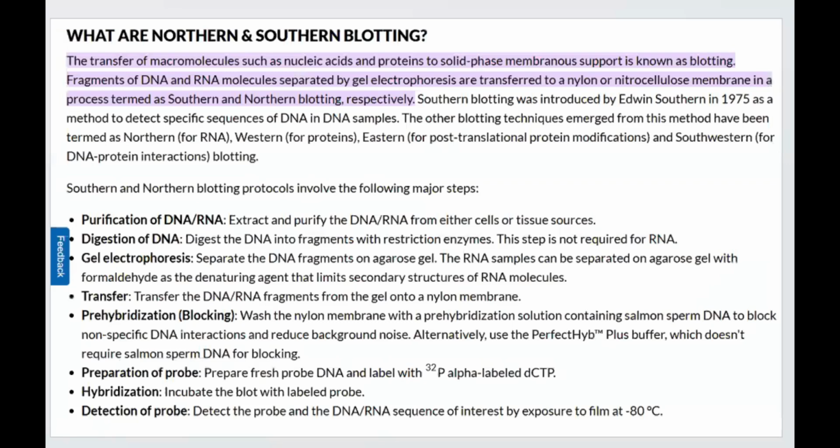Onto that you are going to transfer it, and then you say you have blotted it, and then you are going to analyze with labeled probes. That is how we generally do it. So when we talk about application of electrophoresis, we can talk about northern and southern blotting.